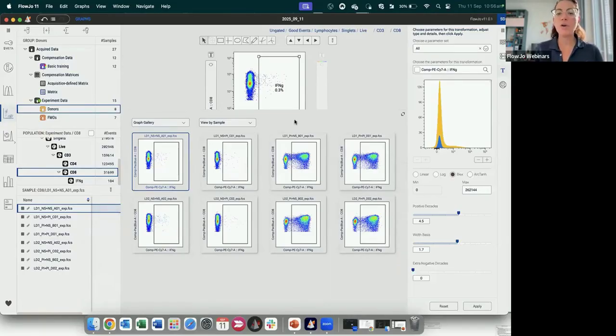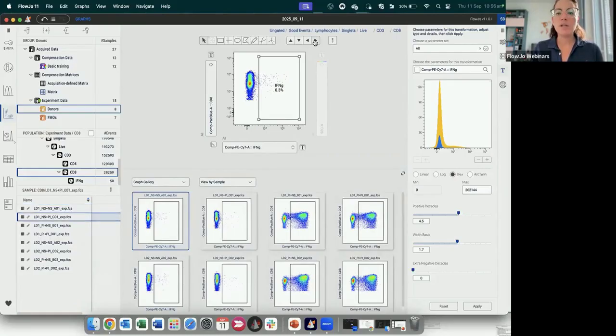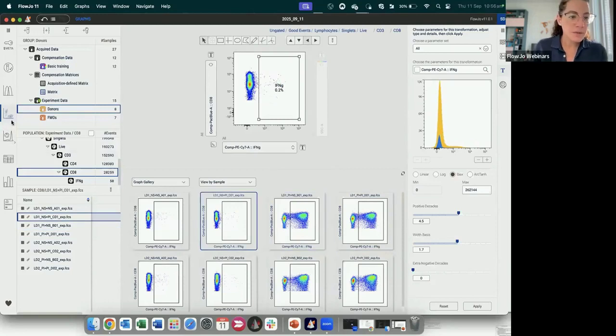So I can see how the amount of interferon gamma is increasing, and I can do the same by navigating onto my next sample. Okay, so I hope this is clear. I can do the same for perforin and phosphor-ERK, but I don't want to take too much time.